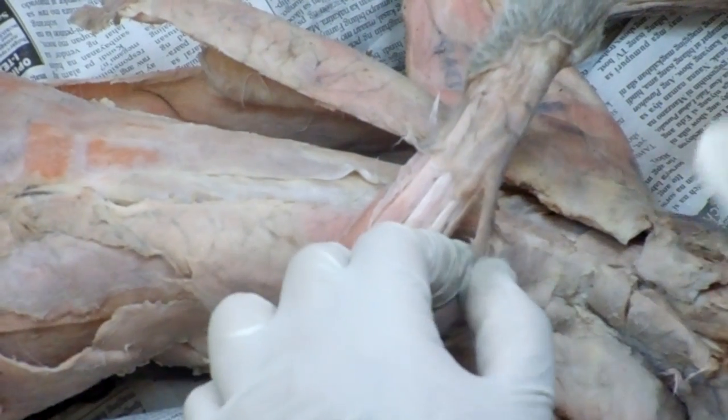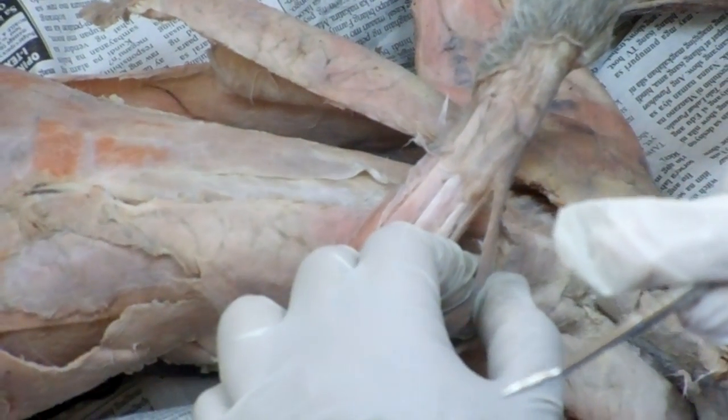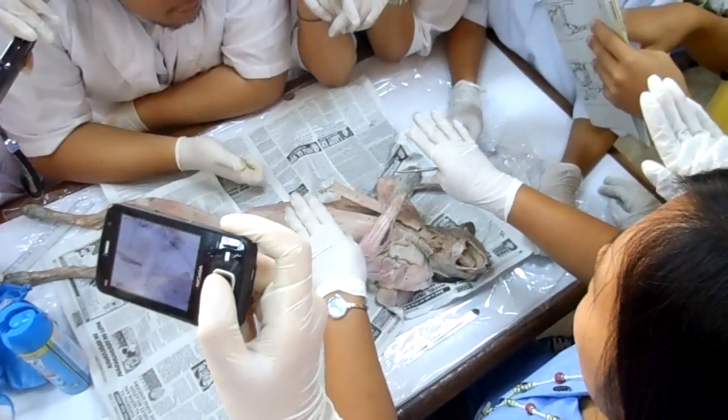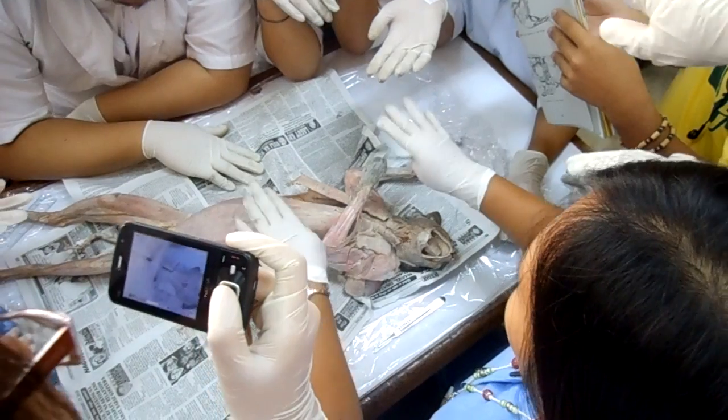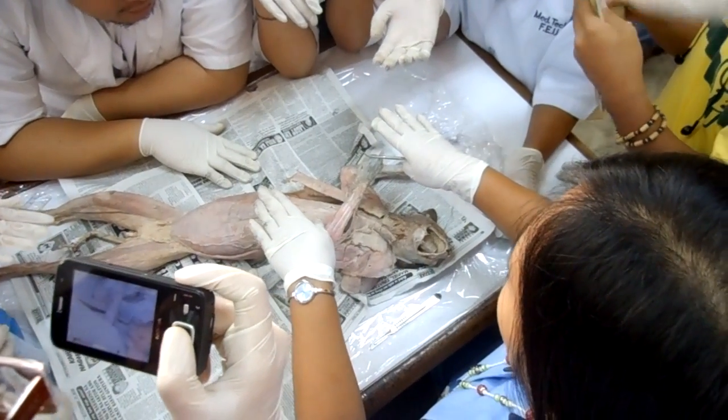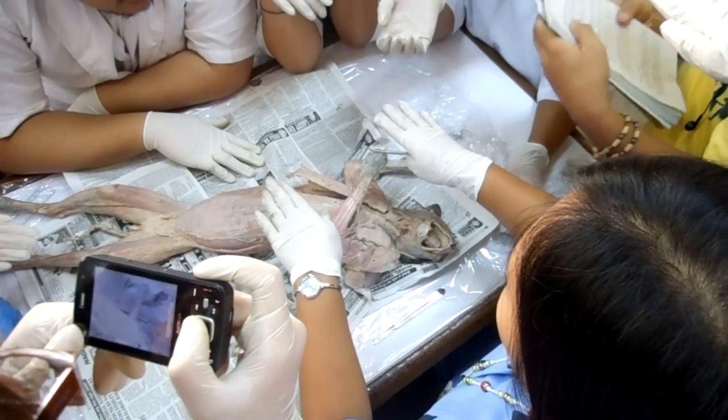Action: rotates hand to supine position. Supine. Ano ang supine? Ito ba o ito? Walang nakakaalam. Supine. Anong position ng hand ito? Opposite ng supine.